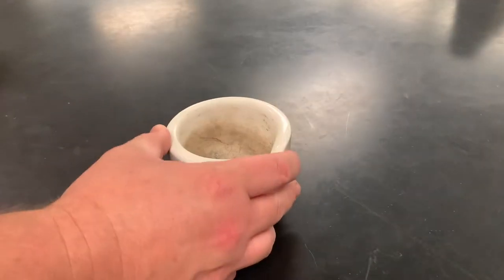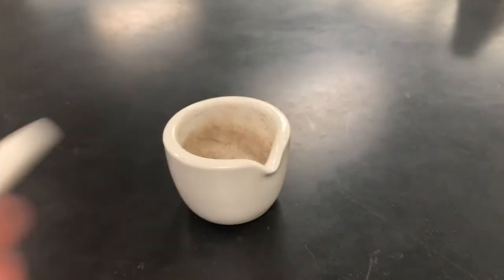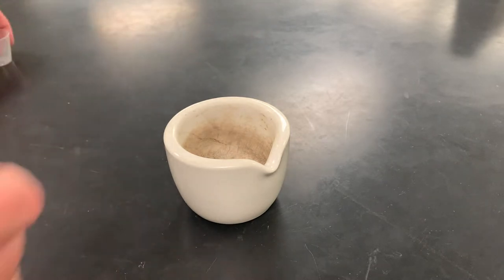So we're going to need a mortar and pestle. Add in stuff.